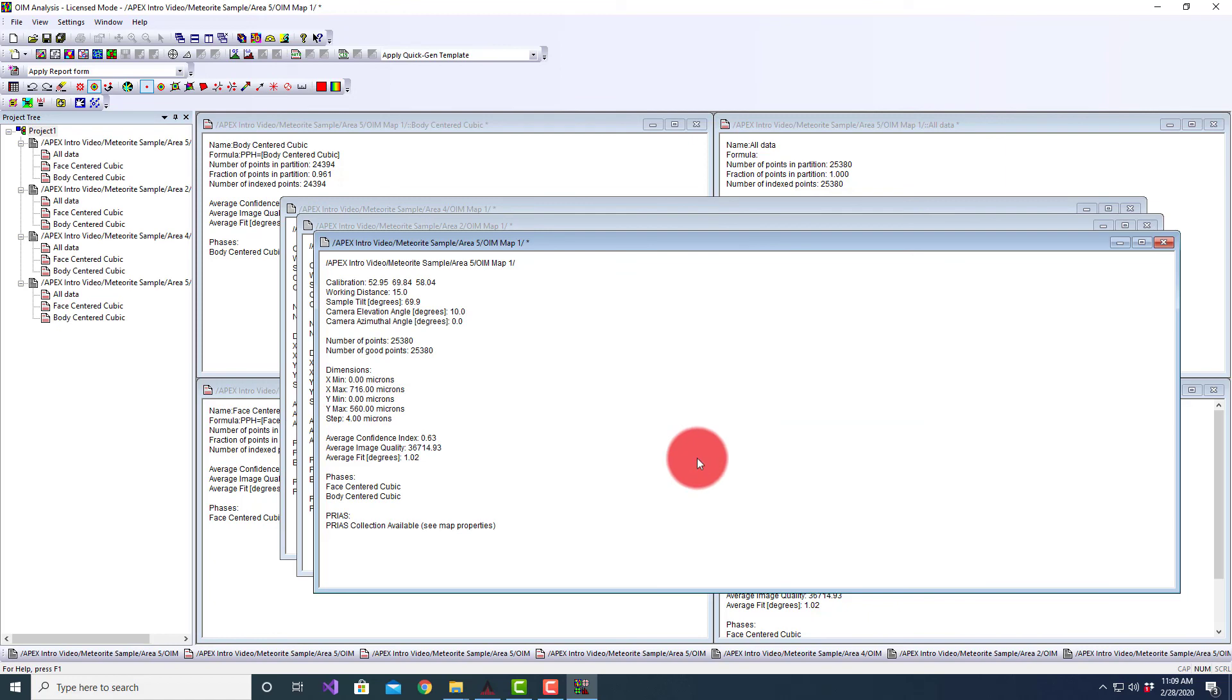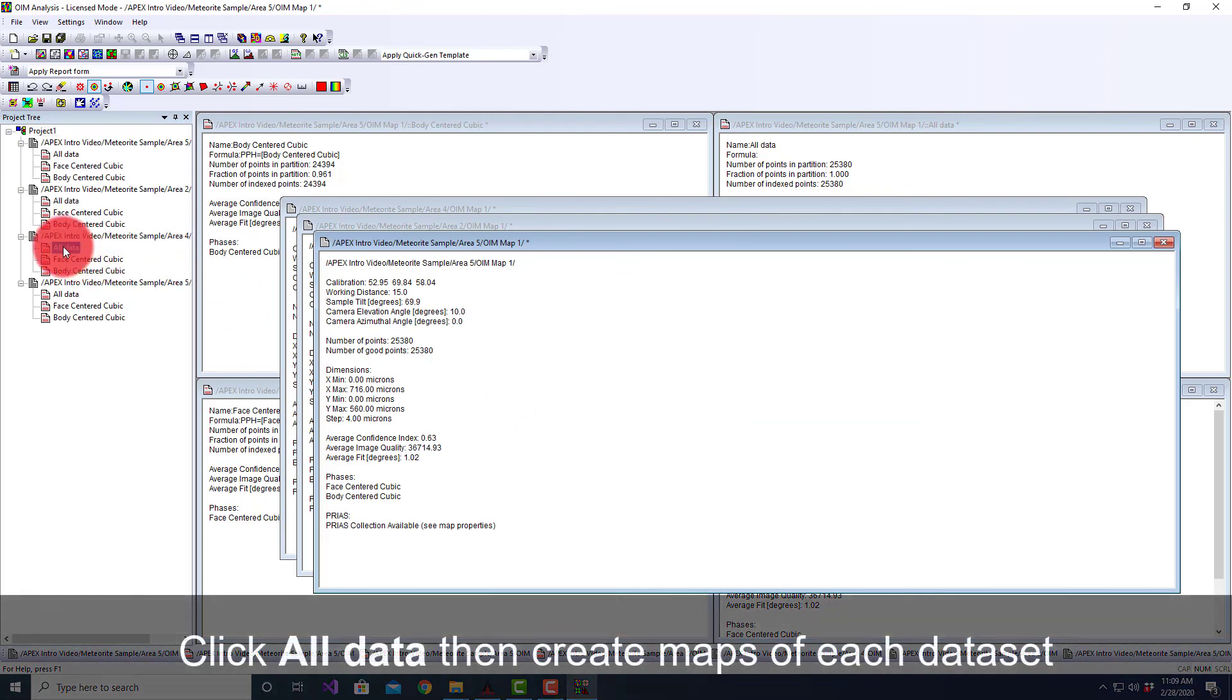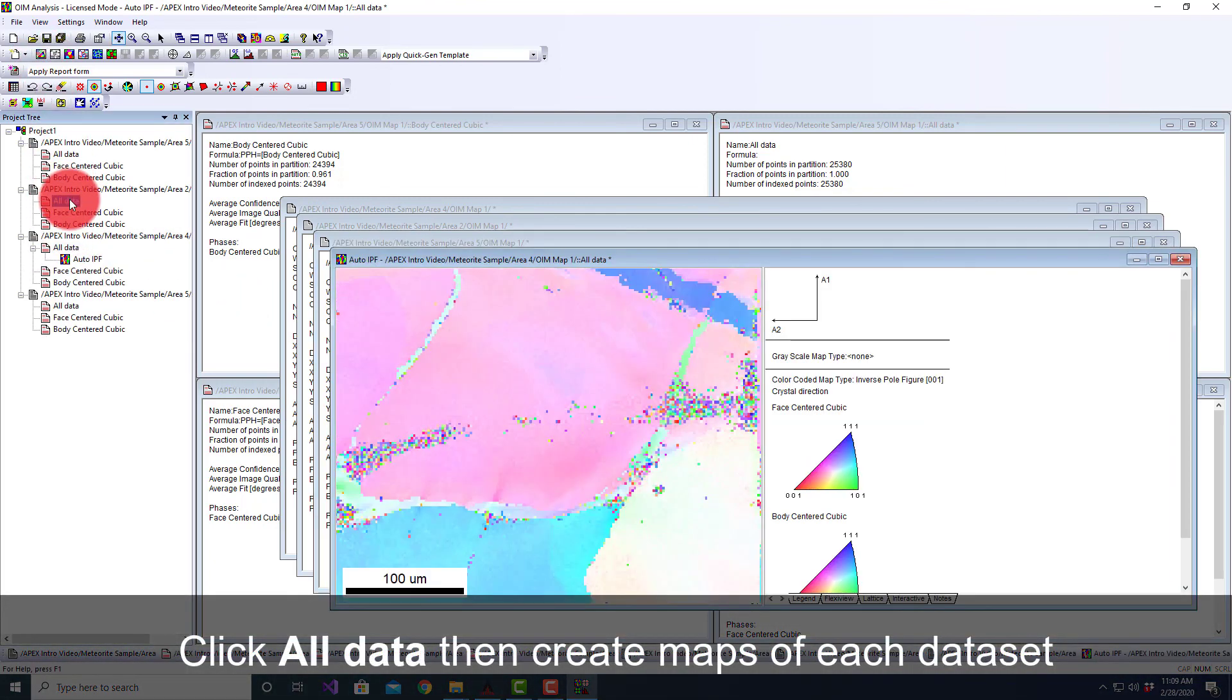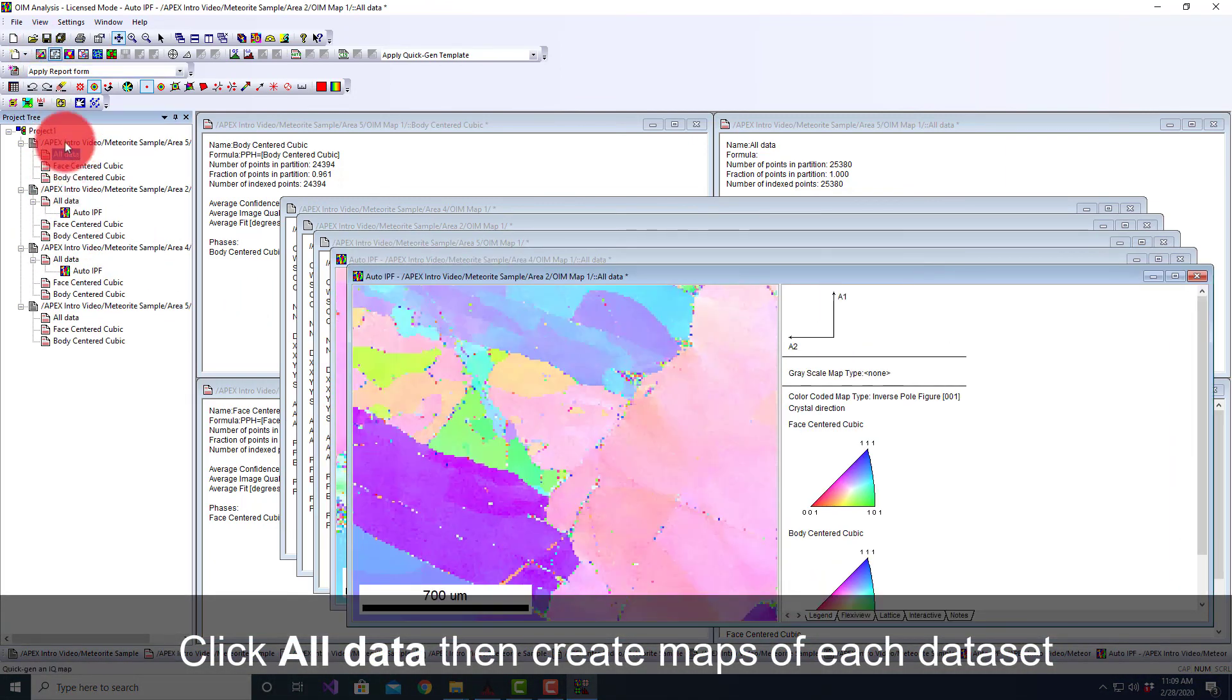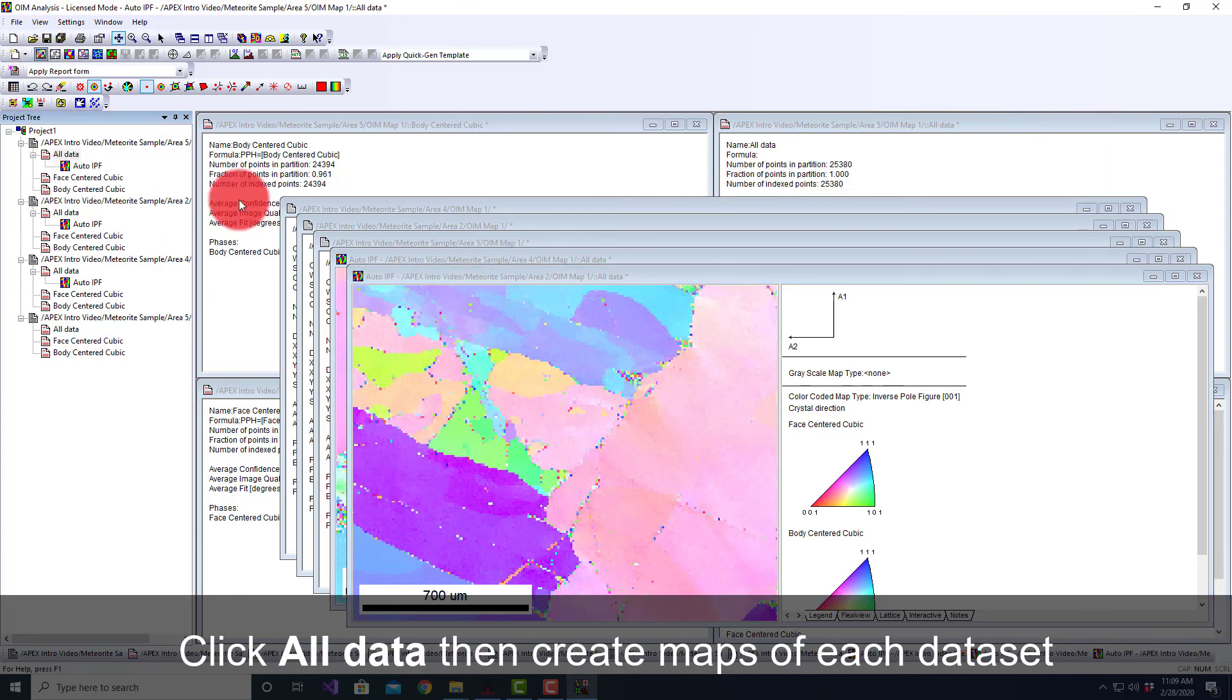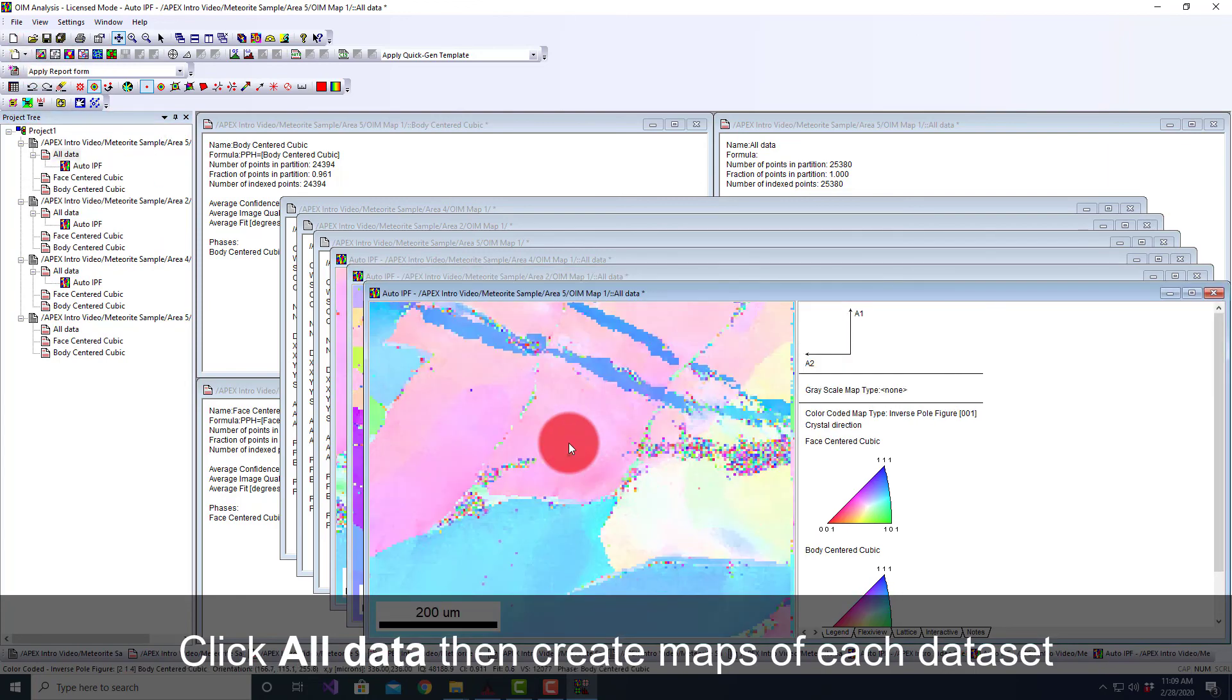And it'll load all three of those at the same time, and I can create my maps from each of those different fields very easily.